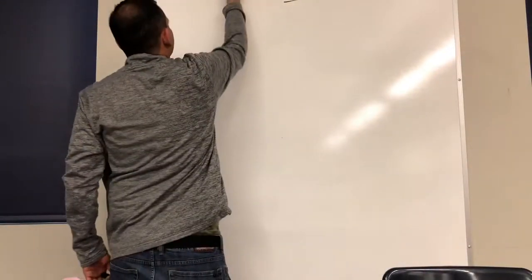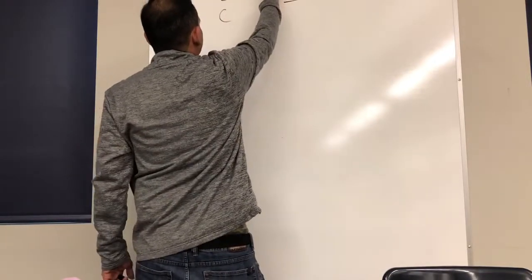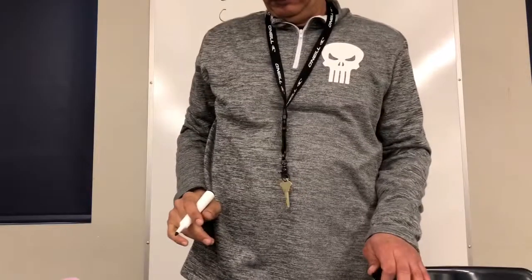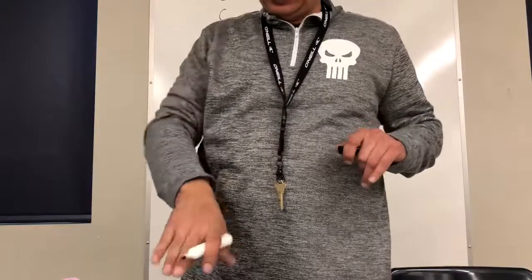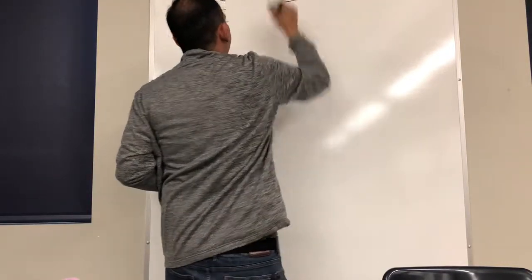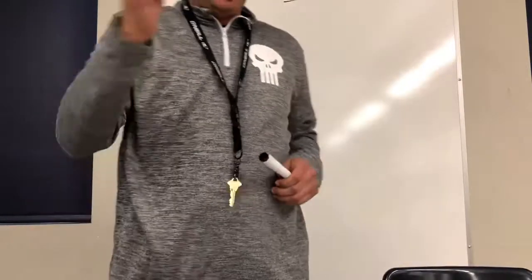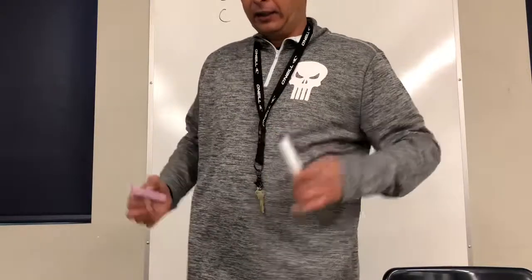I'm going to do that up here, okay? I'm going to call this A, B, C. So far I wrote 29.28 grams, but somehow my brain is off. I had 27.29 grams. It helps to write things down quickly. Sometimes you forget. At this point, you would take your piece of chalk, go outside, write your name on the ground, and come back.